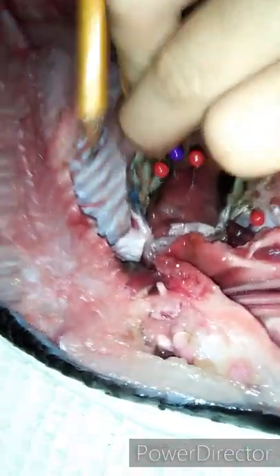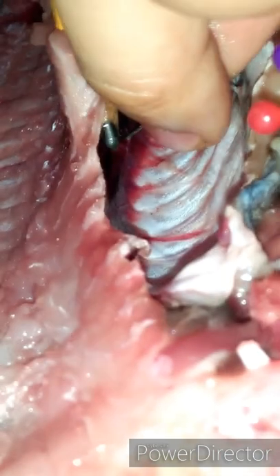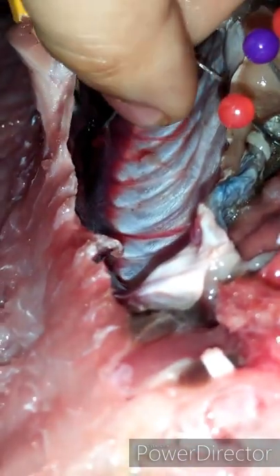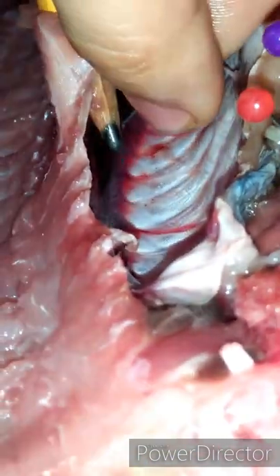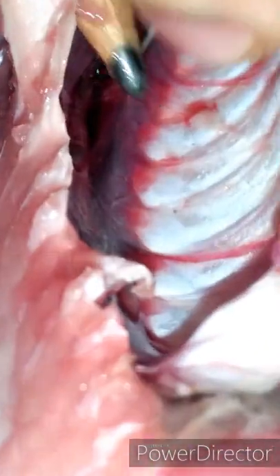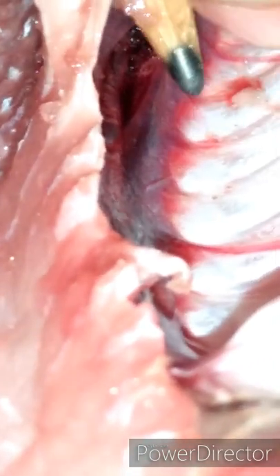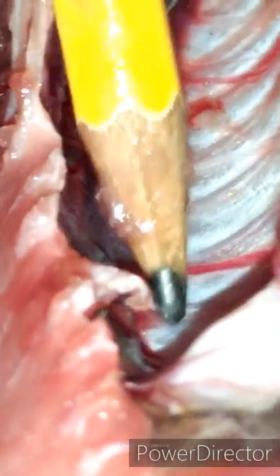This one here is the kidney. The kidney filters liquid waste materials from the blood, and this waste is then passed out of the body. The kidney is also important in regulating water and salt concentrations within the fish's body.